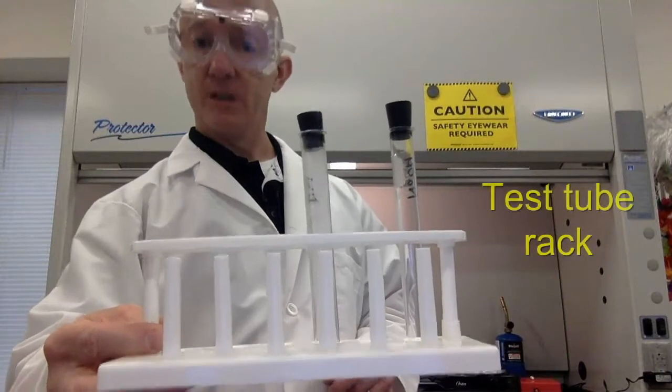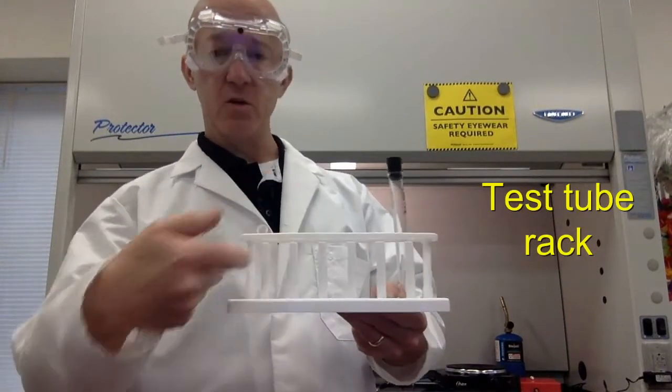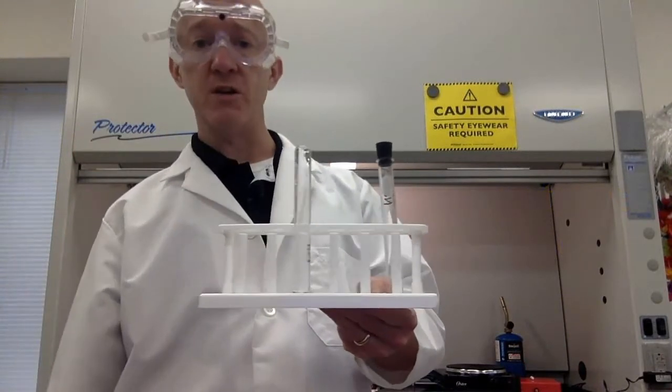Here's a test tube rack. Again, pretty self-explanatory. These posts can be used for allowing the test tube to air dry once it's been rinsed out.